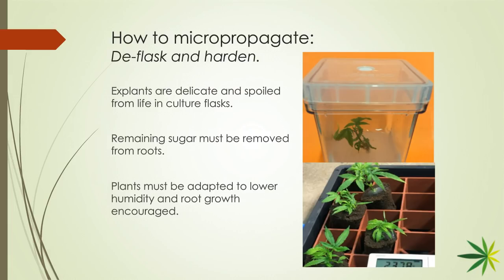Well, it sounds like at this stage in the plant, you're following the same protocol, basically, of a clone coming out of a clone dome, and absolutely trying to monitor it from that same perspective. Those little plants that you see in the lower figure have just come out of the flask. They've been in a dome for perhaps 2 or 3 days, and they're tough enough now that they can handle 70% humidity. But they are only about 2 inches tall. So that's only one difference. Your transplanting process might be a little different because you're working with material that's a bit smaller. A little bit shorter. Yeah, so you've got to take better care of it. Different care of it once you're getting it to soil.